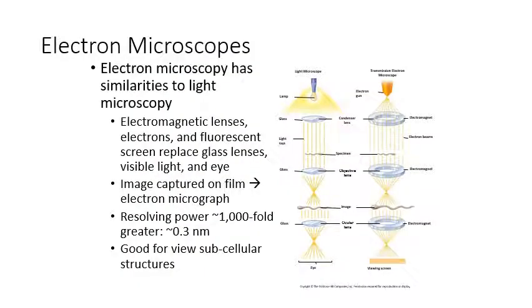All right, so that was a light microscope. Moving on to an electron microscope, again, these are the type of microscopes that you would need to look at very small structures. So the organelles within cells, even some large macromolecules we can visualize with electron microscopes. But these are very expensive equipment, and they don't use light. Instead of using light, they shoot beams of electrons.